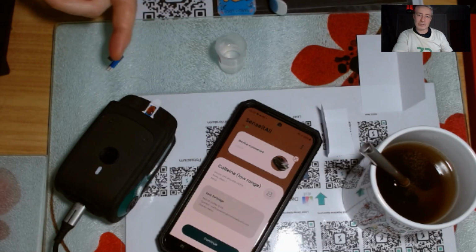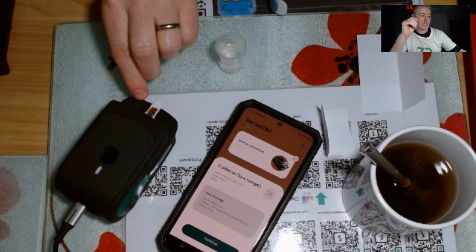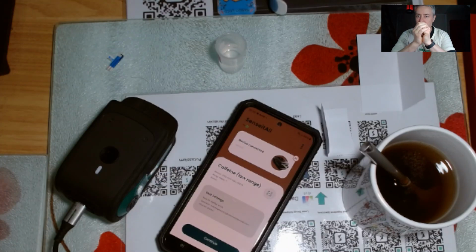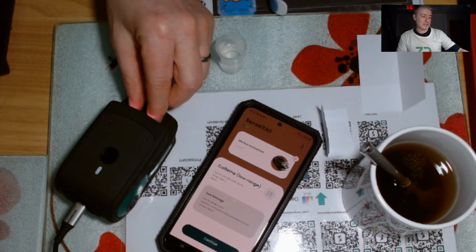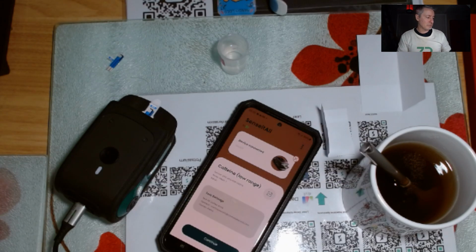I mean, imagine what I have to do now, especially if this was a real sample. You're going to have to clean that. You have to guarantee that you cleaned it, and that in the cleaning process, you didn't leave anything on it. So the best way of dealing with that situation is you take the sensor like that and you throw it in the bin, because imagine the validation of actually saying, yeah, I got that sensor completely clean, I didn't leave any sample on it. Come on, it's not going to happen. So I put a clean sensor in here, I close that up, job done.